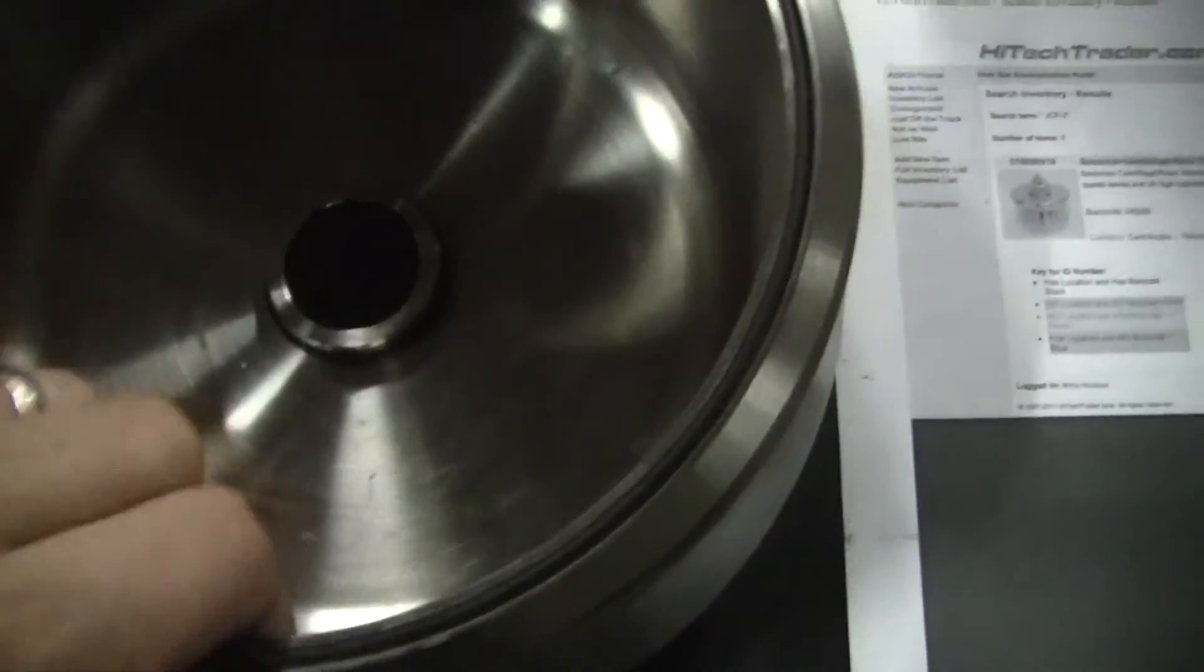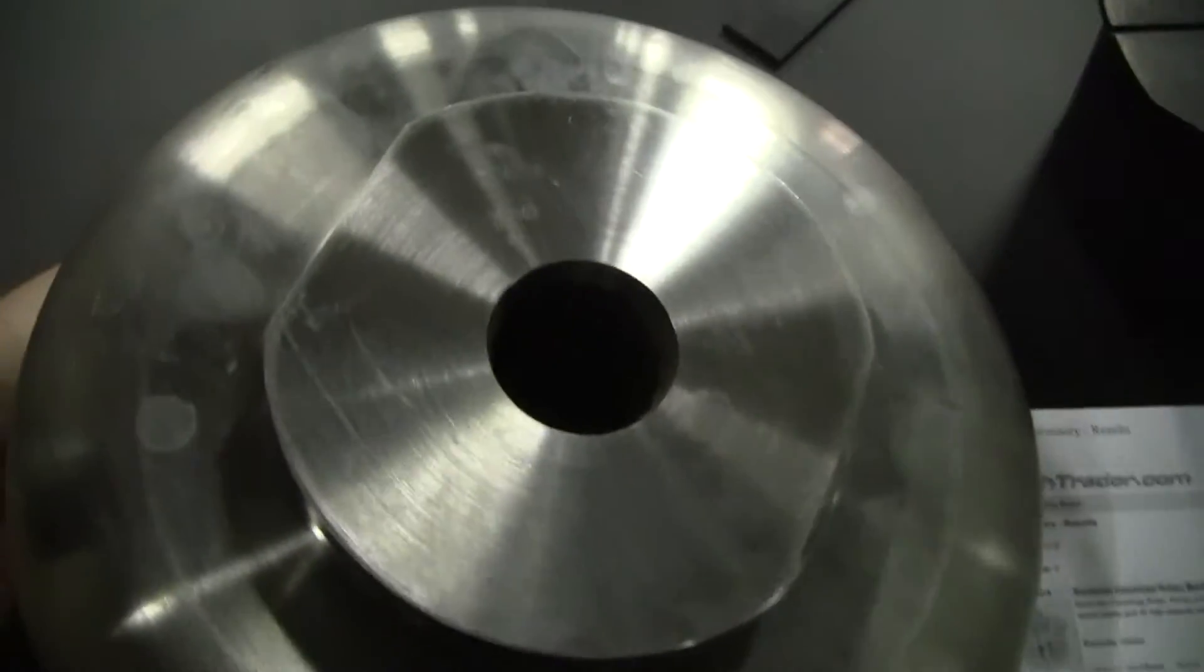And the main unit. It's got a hole in the bottom, obviously where it comes up. Set on the bottom. And corresponding 770 on the bottom there.